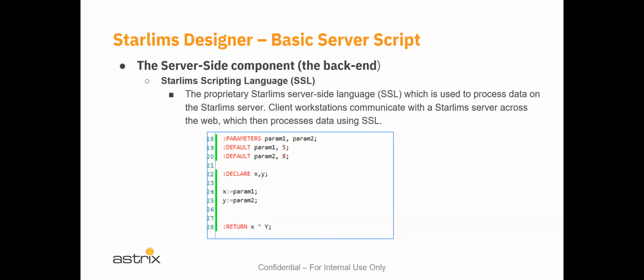Within the STARLIMS system, we have a pretty extensive help system, and so you can go into the server-side SSL reference, and we'll see what all of these commands do.